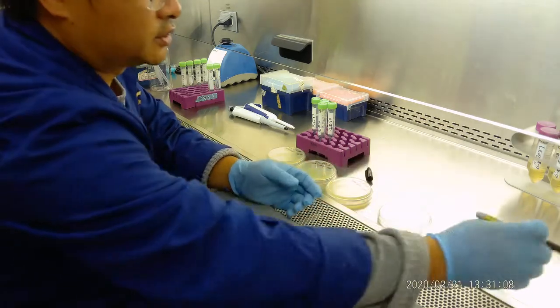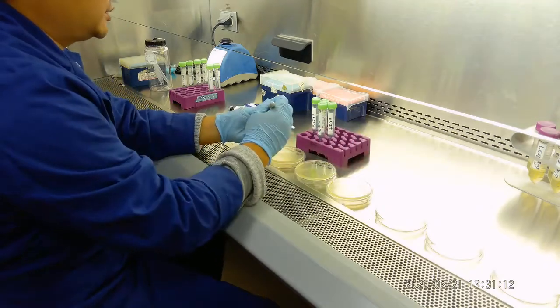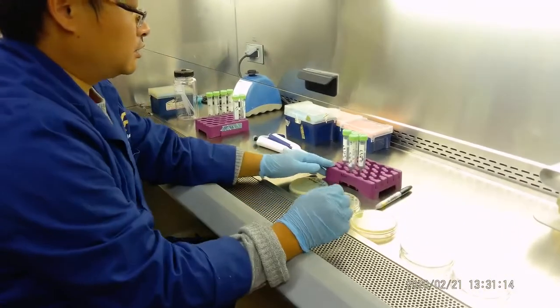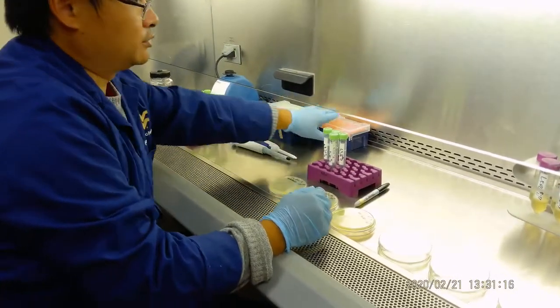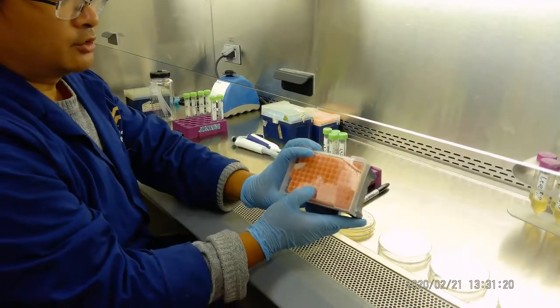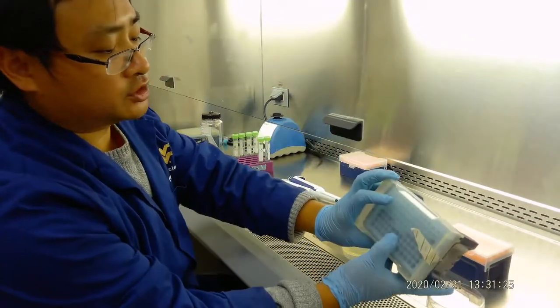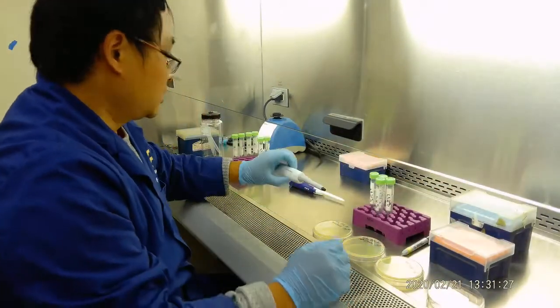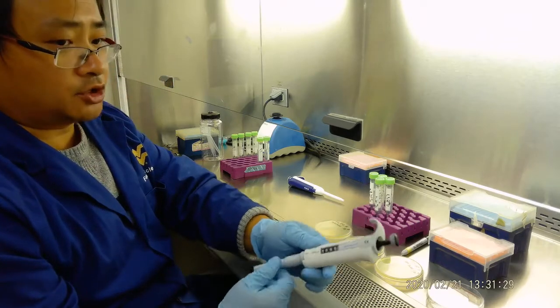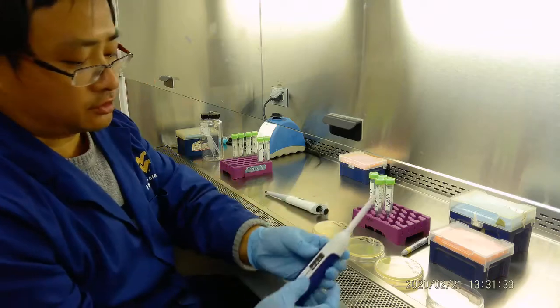So we'll be doing this a little bit differently. Okay, now the next thing we're going to do is a dilution. So how do we do a dilution? Here we will prepare the pipette tips, using 100 microliter and 1000 microliter. And we have pipettes; make sure this one is set to 1000, and this one is set to 100.